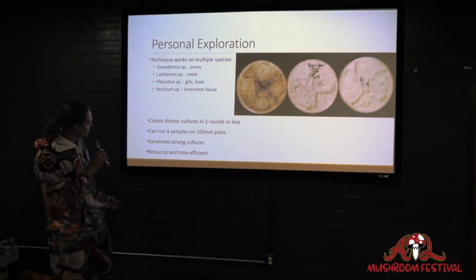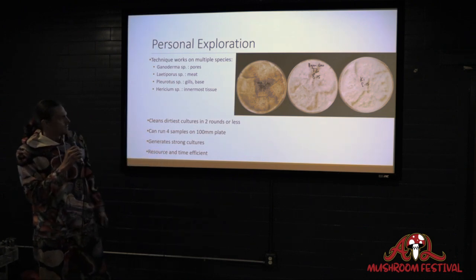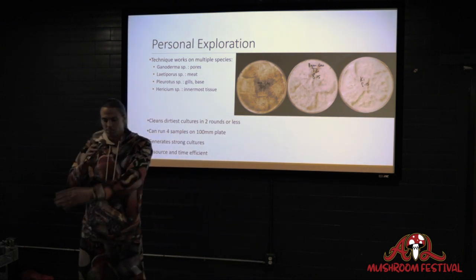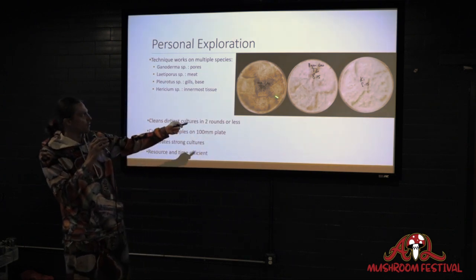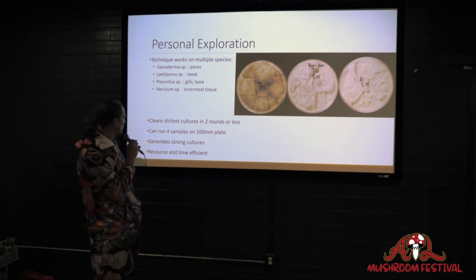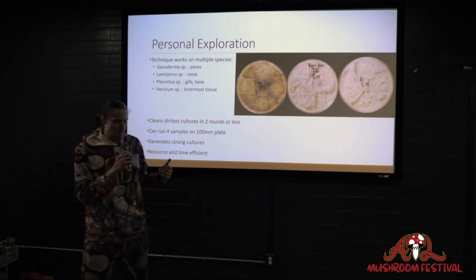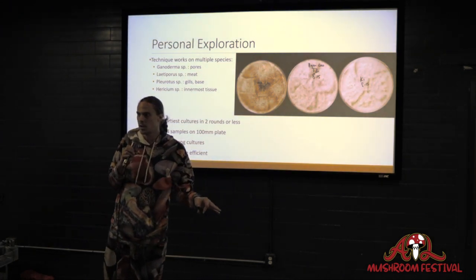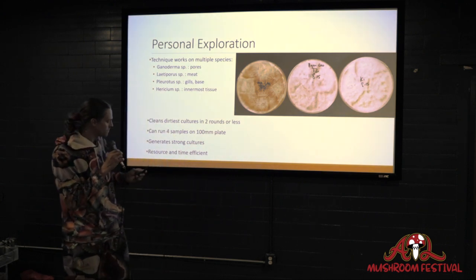And what's great about this technique too is I can run 4 samples on a single plate. Oftentimes, you can't multiplex like that. You have to do 1 sample per plate. But with this, especially using this technique, I can run up to 5. So you have your 4 corners and then even 1 in the middle. So depending upon what you're trying to do and how you're trying to do it. And I've definitely found that it's generating stronger cultures. It's much more time and resource efficient. I'm not having to use 5, 6, 7, 10, 20 plates in order to clean up a culture and to know for a fact that it is wholly clean.